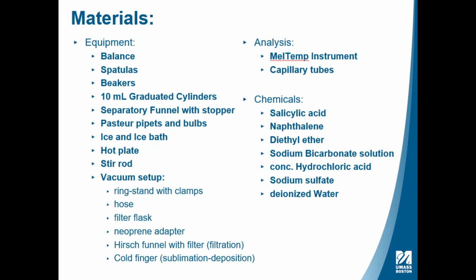The chemicals we will be handling over the course of the experiment are salicylic acid, naphthalene, diethyl ether, sodium bicarbonate solution, concentrated hydrochloric acid, sodium sulfate, and deionized water.